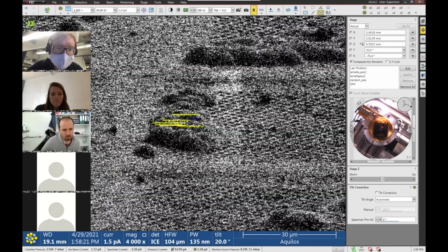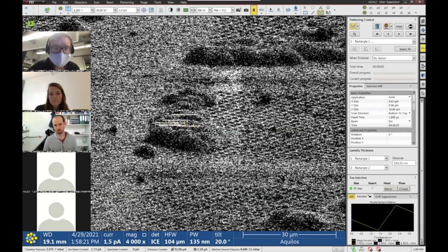This doesn't correspond to the position because we didn't do the correlation on that position, right? But the correlation spots would then be, I see them as little arrows, these patterns. So the correlation spot would be at the right turn spot of that pattern. So you could just take those, put them to not active, and now you know precisely in the framework of your original image where your correlation spots should be before milling. But at the end of the day, you can just use these spots in order to guide the automated setup in the main interface, right?